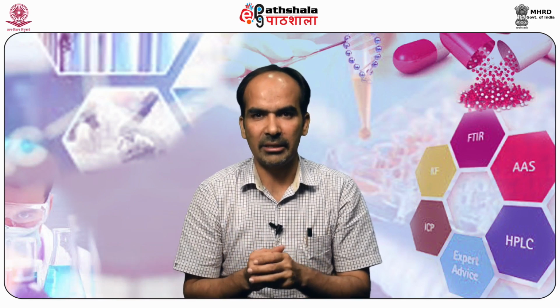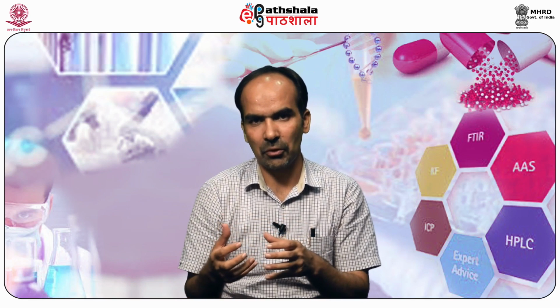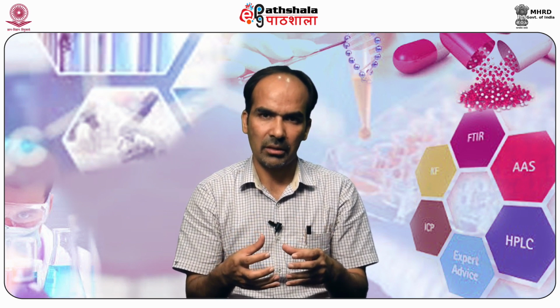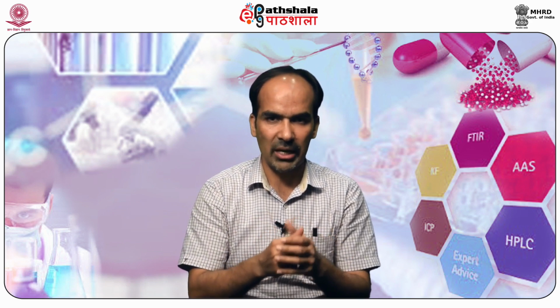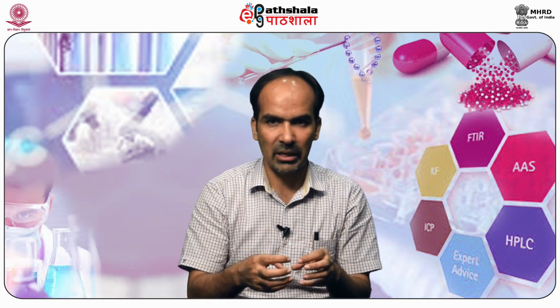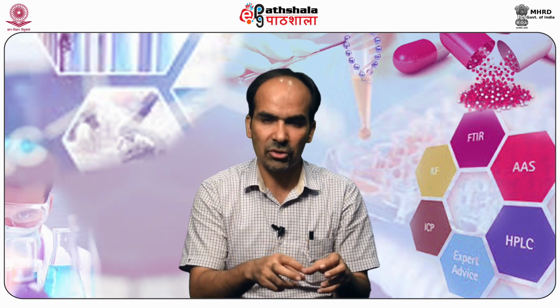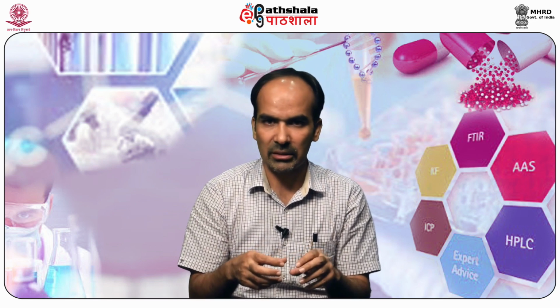Fluorescence analysis is another type of spectroscopic analysis which is very useful, particularly with respect to natural products. Here, some substances, when they are irradiated with UV light, emit a longer wavelength, or they remain colored for some time. This is known as fluorescence. The process is called fluorescence. And the process of recording that emitted light is known as fluorescence analysis.